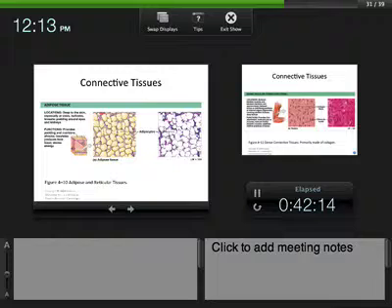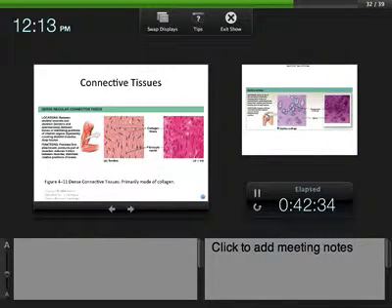Adipose tissue is super easy to identify because it's mostly just white. It's these big fat vacuoles with all the cytosol of the cells crammed to the side. All right. Adipose tissue, another loose connective tissue. All right, so I guess I didn't have any reticular tissue.